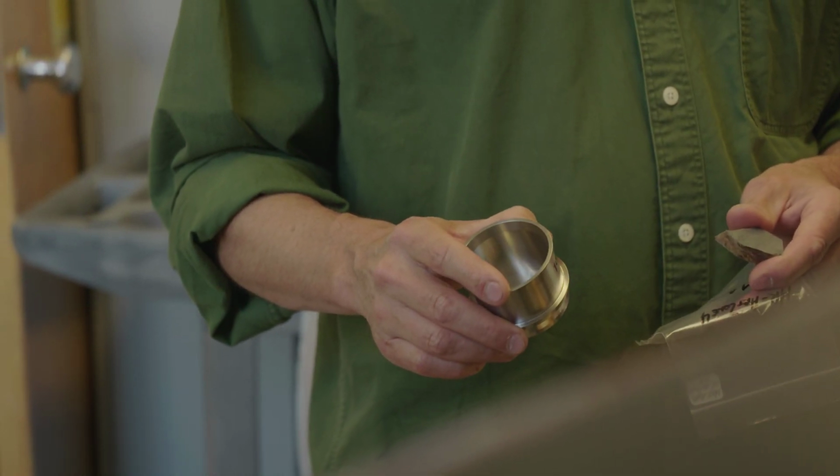Well, this is from a quarry that's right near the university here, pre-contact quarry. We actually find flakes of this at Île Saint Bernard. So what we're going to try and do is analyze the geochemistry of this hornfels from this quarry, just to make sure and prove that it is actually what we find at Île Saint Bernard.